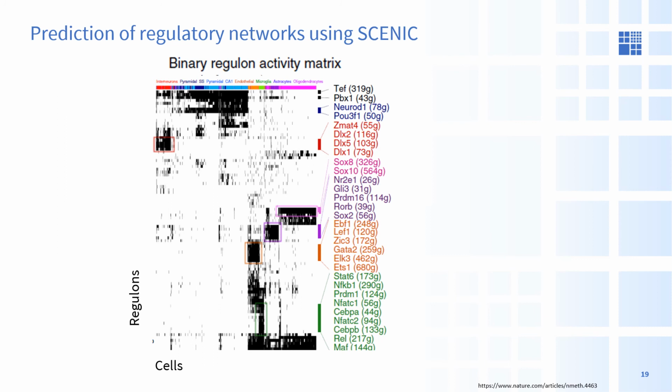So these networks all group genes into co-regulated modules, which can show specific activity in a given condition, treatment versus control, across differentiation stages, or in the case of this example, by cell type. So highly active modules for the SCENIC package are shown in black, and it is clear that this technique is a powerful hypothesis-generating tool for driving networks of a given cell type or process.